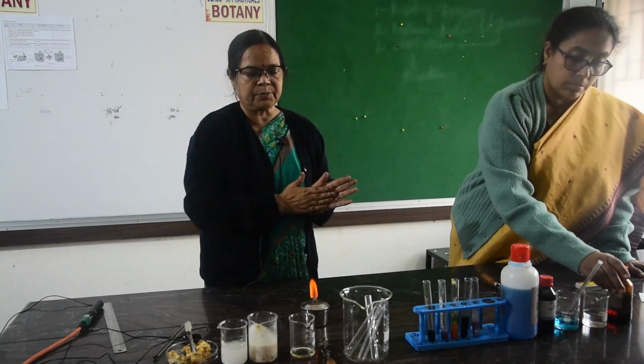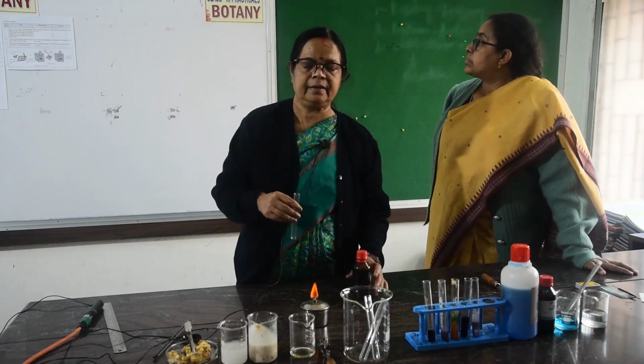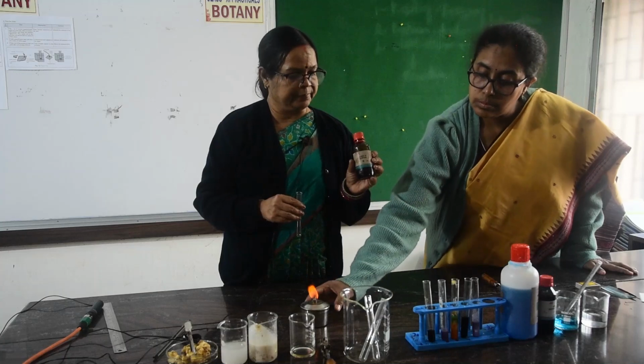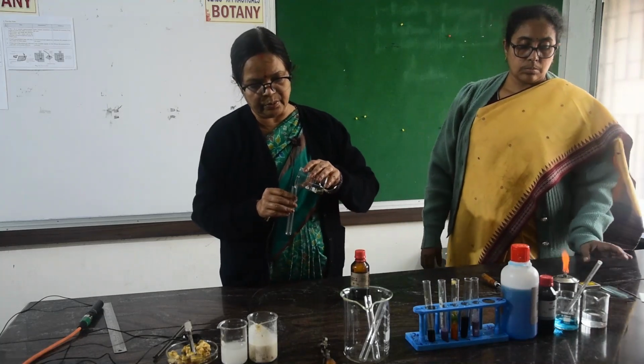Next is the test for fat. Various tests are there. You can dissolve the fat in benzene, but one most important test is the test with Sudan III. Sudan III is the reagent used to test for the presence of fat.